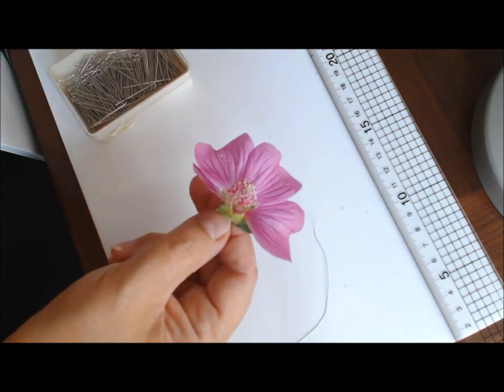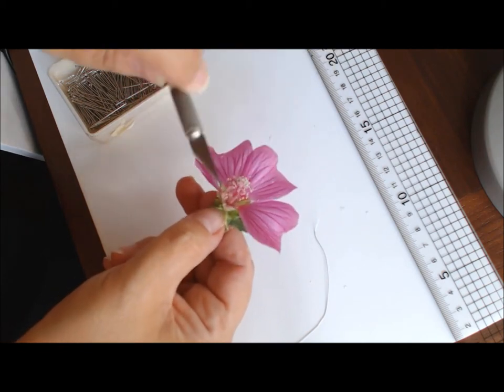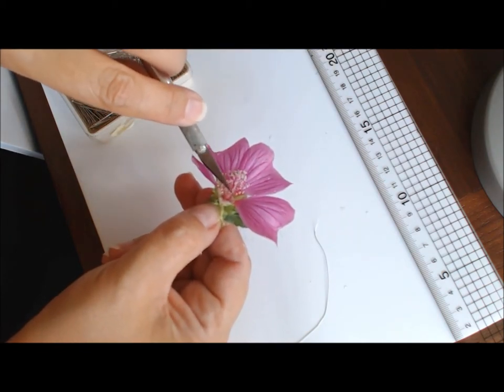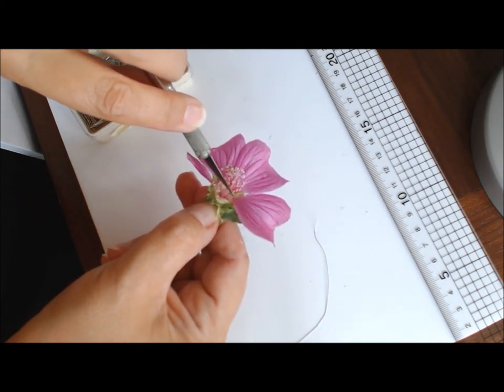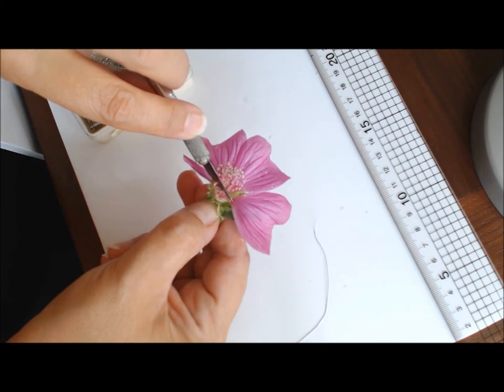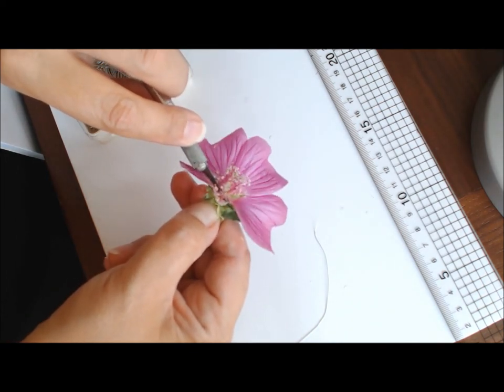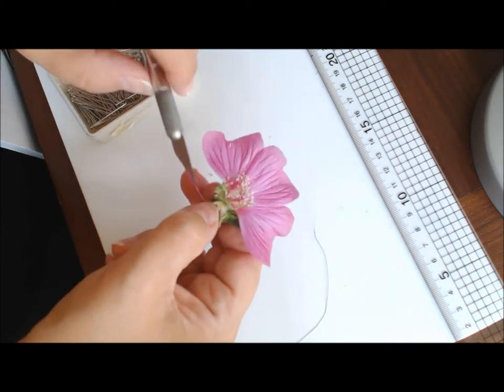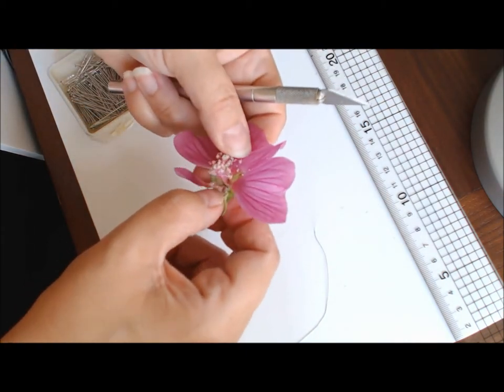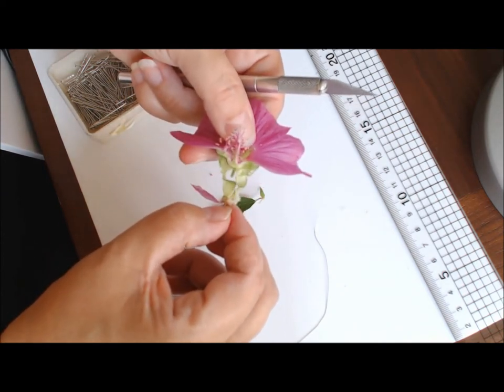Obviously, the smaller the flower is, the more difficult this is. I've chosen a large flower to make it easier to show you. So I'm trying to cut through the column without going too far through it. And that's going through it, down the center.